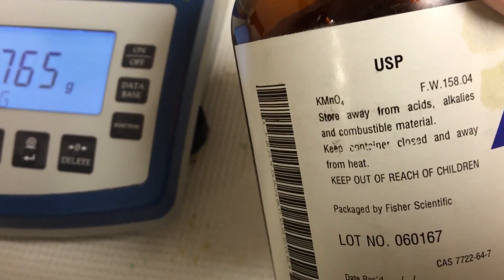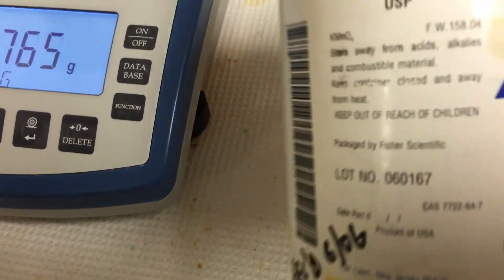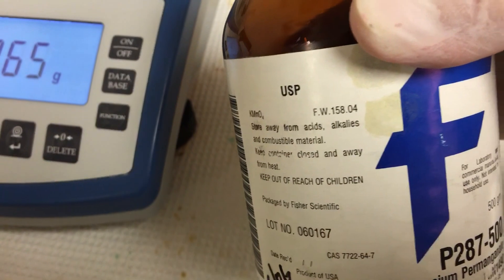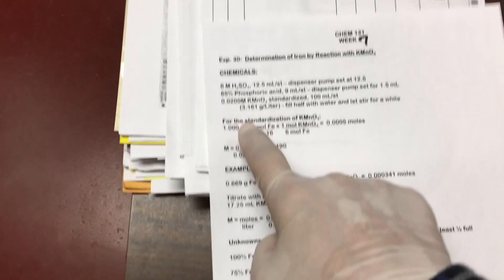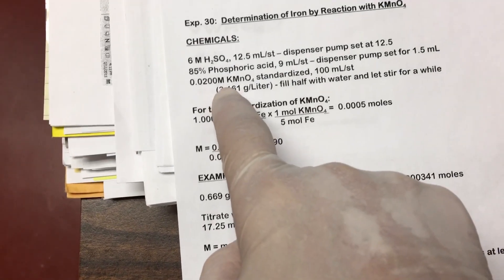Based upon this, the KMnO₄ — potassium permanganate — you might look at the formula weight, it's about 158. You can do the back calculation or do the straight calculations. We're going to make it at 0.0200 molar.